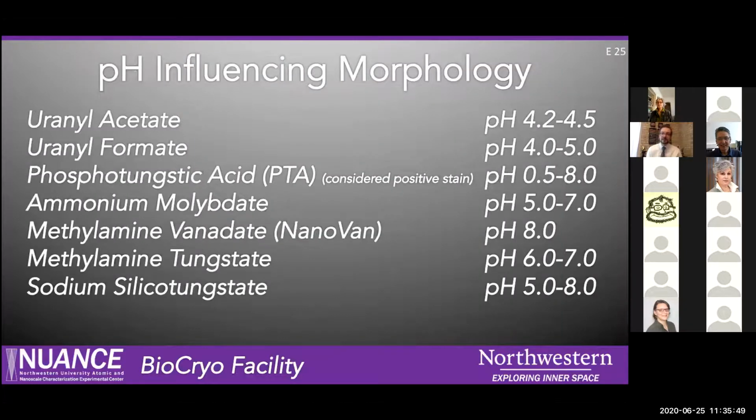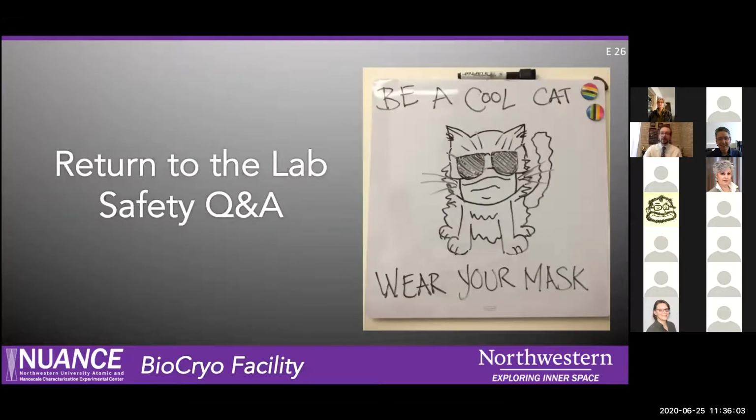And just to refer back to our list of common negative stains, you can see they all vary quite a lot in pH. So again, take that into consideration when you're planning your experiment. So here, that's all we have to say about negative staining. Again, hold your questions for a minute.